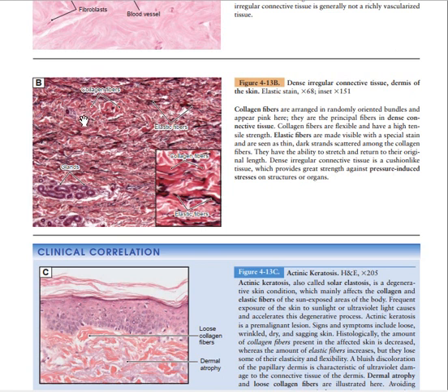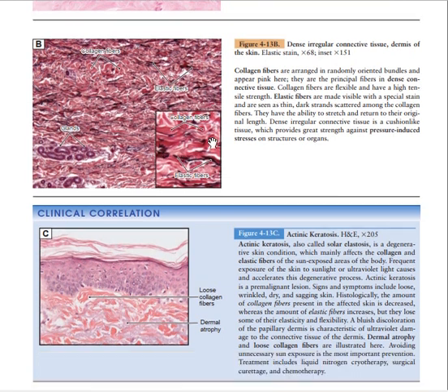In order to identify the collagen fiber, you see that when you use hematoxylin and eosin stain, you cannot easily identify the elastic fibers. Is it clear? That's why you mostly see collagen fibers pinkish. Now you can visualize elastic fibers easily when you use the elastic stain, and when using the elastic stain, you're going to see that the elastic fibers are dark colored.